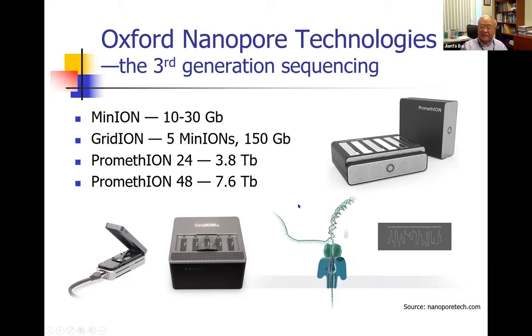The second generation is sequencing like 150, 200 bases. And with this one you can sequence like 10 times more, or even 100 times more. So why is that important? It's because in a lot of genomes, including bacteria, they have genome rearrangement. A piece of the genome is shuffled to a different place. With second generation sequencing, it's really difficult to figure that out. But with third generation, that helps a lot. You can figure out where the reshuffling happened and where the deletion and insertion happened.